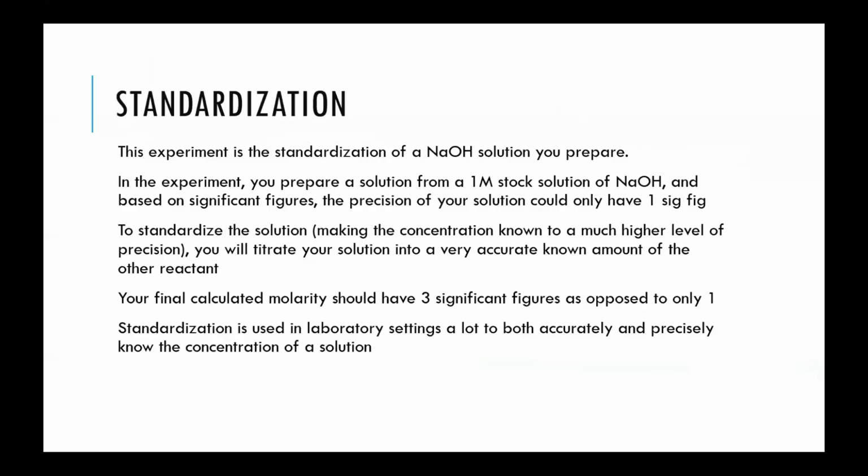The experiment itself is looking at the standardization of sodium hydroxide. You're standardizing a compound to get a precise and exact measurement of the concentration. The stock solution that you're working with is 1 molar, and that is the only level of significance that it has, a 1-digit level of significance, only one significant figure.